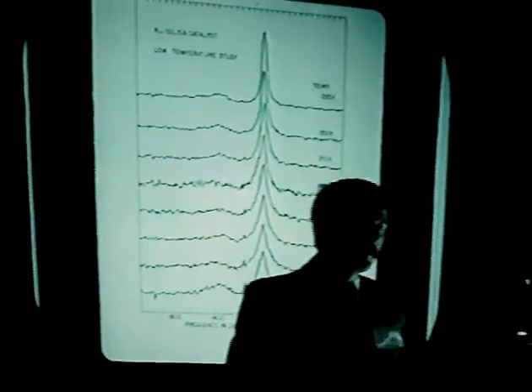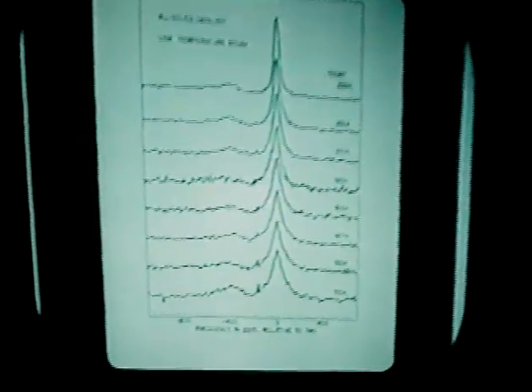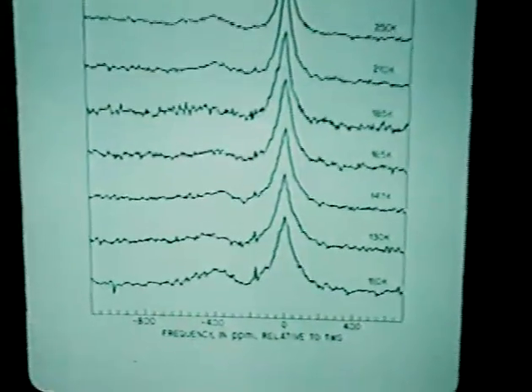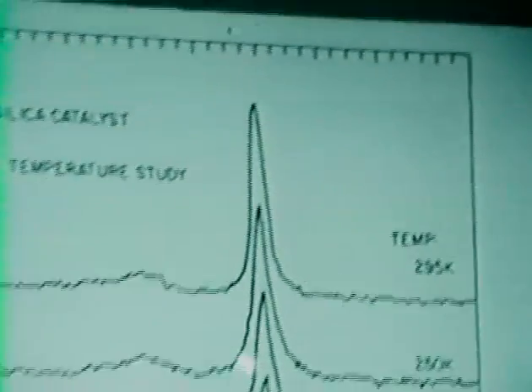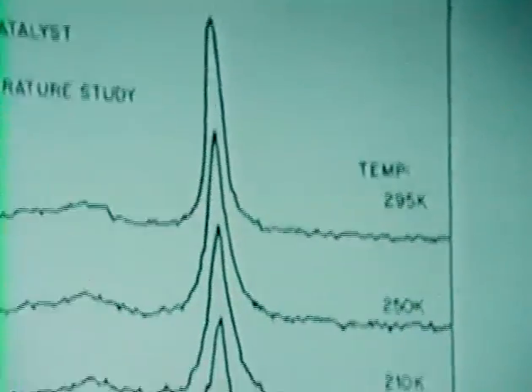One sidelight. We can also do dynamics in a different way here. Rather than looking for the T1 contributions, we can look at the line width contribution. That is, as we cool this alkyl group down, we look at the broadening of this line as a function of temperature. Okay? Which relates exactly to the correlation time for that type of motion.